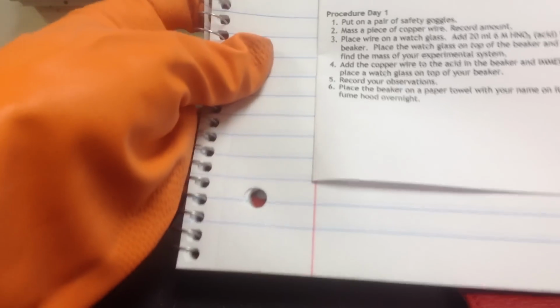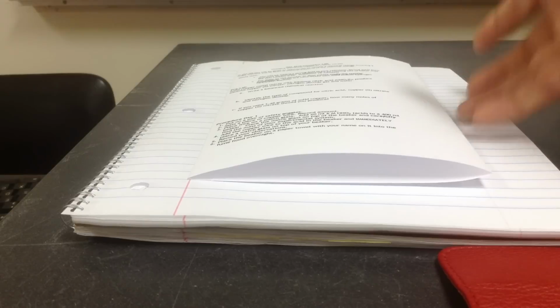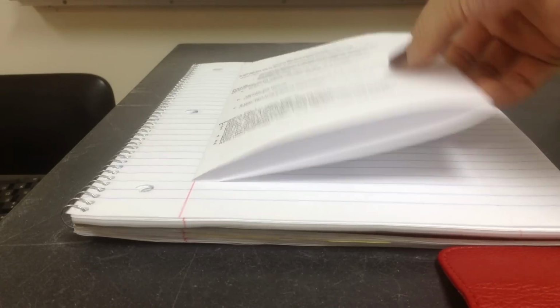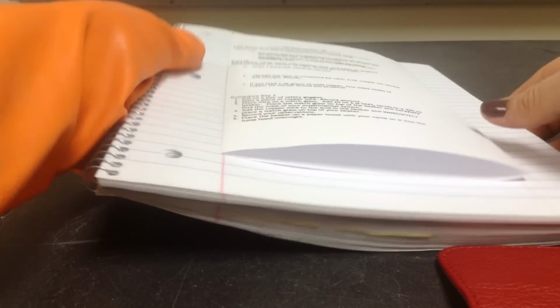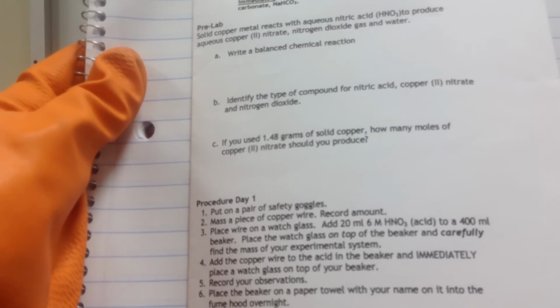Okay, so today we're doing the demonstration for the gas stoichiometry lab, and hopefully you have this paper, you folded the tab and glued it into your spiral, and you can fold this in half also so that it fits nicely in and you have some lined space to do some of your calculations. There is a pre-lab that will be very helpful to you in answering your questions. So even if you did not do the pre-lab questions before the lab, you really want to do those before you get to your final analysis questions.